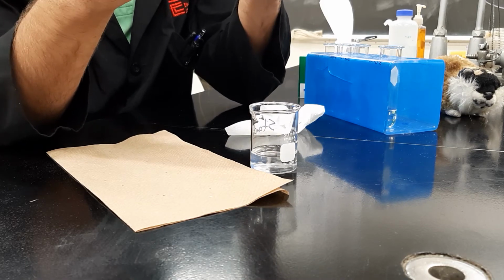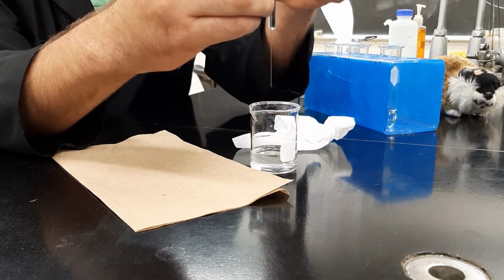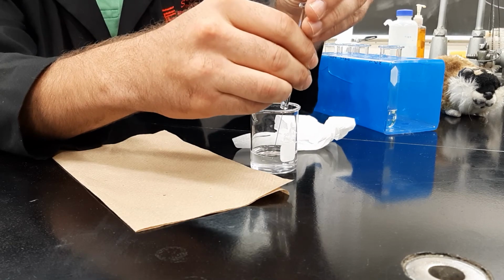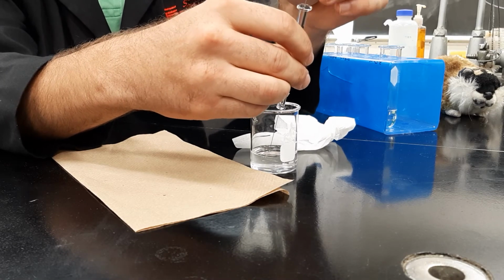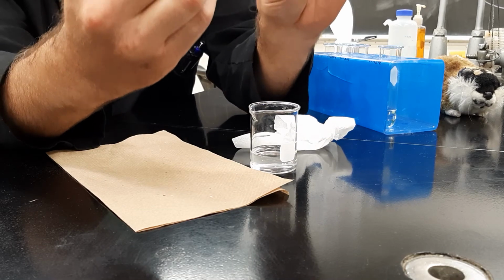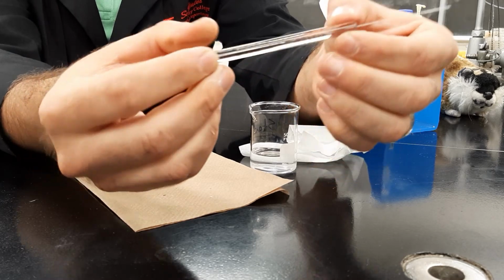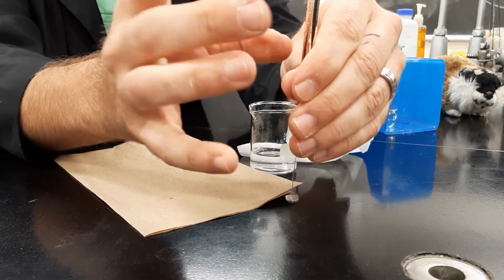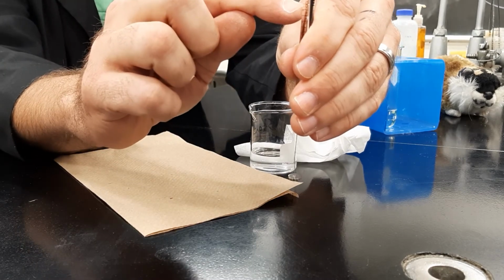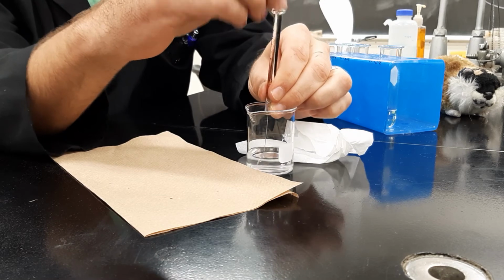No, there's still a tiny air bubble. So little air bubbles here will clear the same way. But if I force an air bubble, sort of show you what it's like. An air bubble like that size is going to be almost impossible to clear. It just won't move as you flick it. So in that case, in this case where it's in the middle, you're hosed. You need to start over. You put it back in and get that expelled.